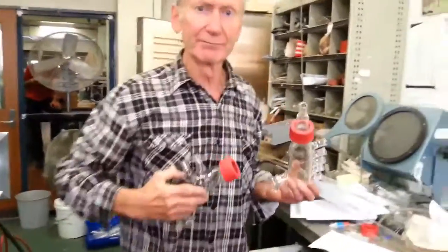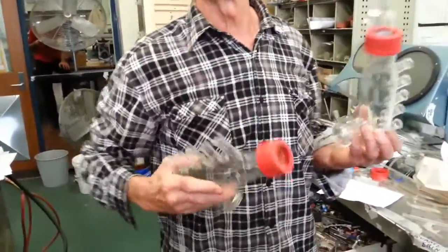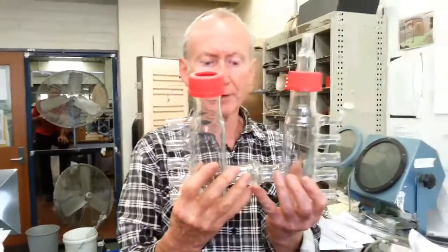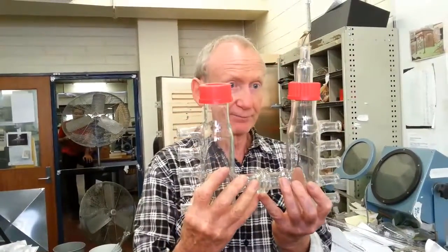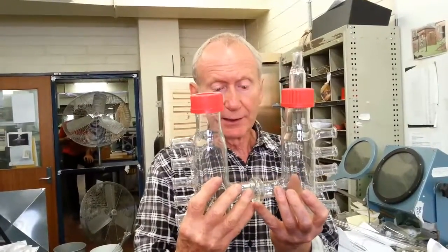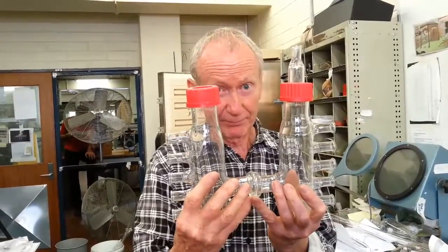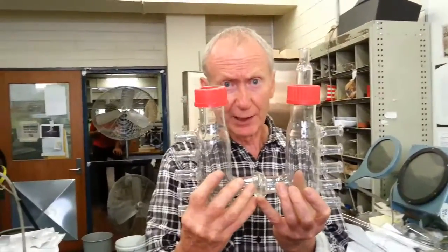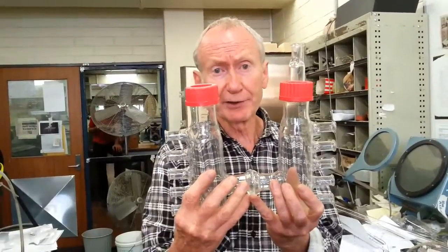This unit here is for analyzing and testing bacteria in the sea. And what we can do with this is we can make electricity from the bacteria.